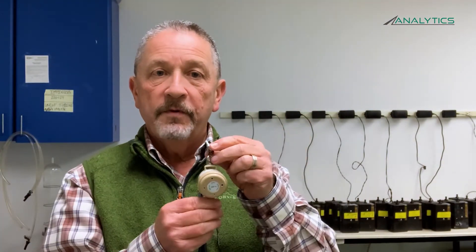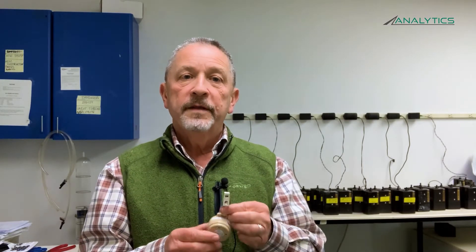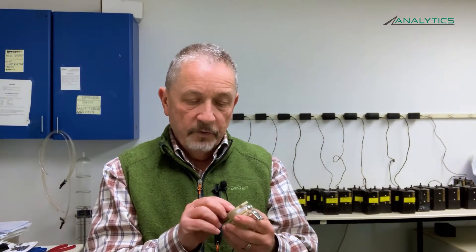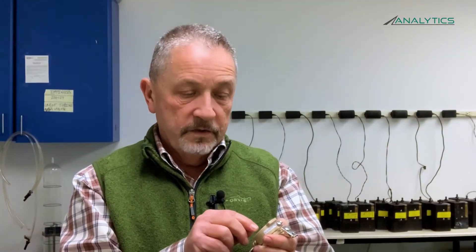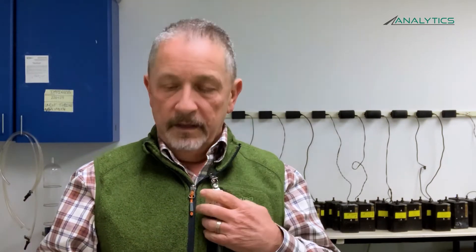Once you verify it's running at two liters per minute, turn your pump off and disconnect your calibration setup. Take your PPI from your Ziploc bag. This is where you start marking your paperwork and your PPI so that the sample identification on the PPI matches your paperwork. Analytics will put a serial number on every PPI, which you can use as your sample identification — just transcribe that number onto your chain of custody. Connect your PPI to your pump, connect it to the worker's collar, turn your pump on, and record your start time.